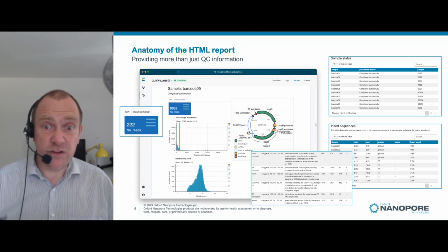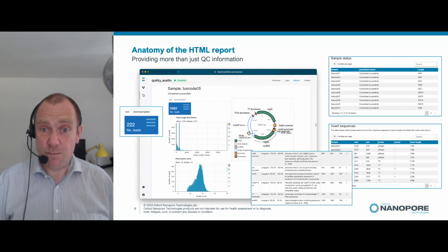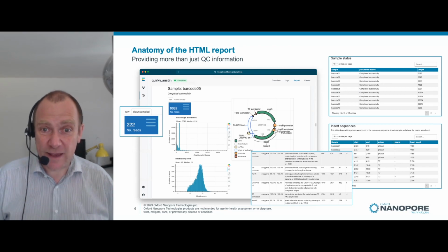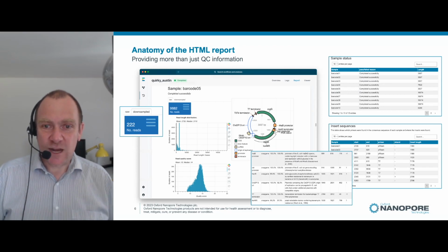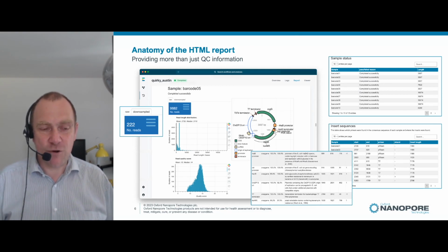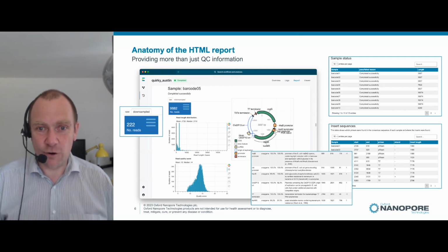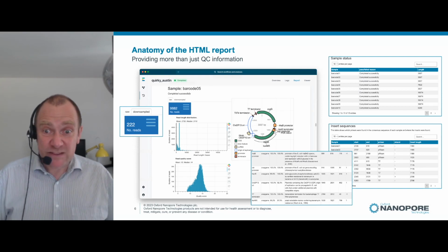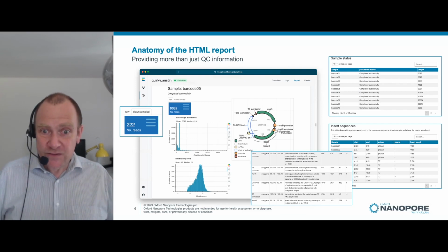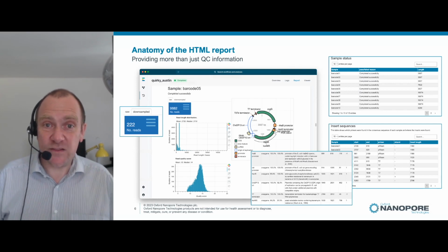Here we can see that we've got a circularized plasmid sequence of 3.0 kilobases of sequence. We can see the clone sequence, we can see the antibiotic gene, we can see the location of the primers and the particular origin of replication. So hey, this is an entirely satisfactory looking plasmid sequence. So this is a successful plasmid assembly.